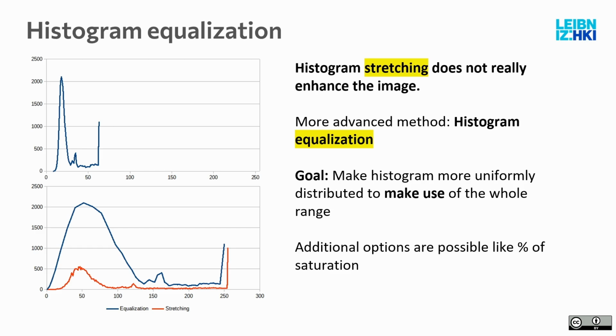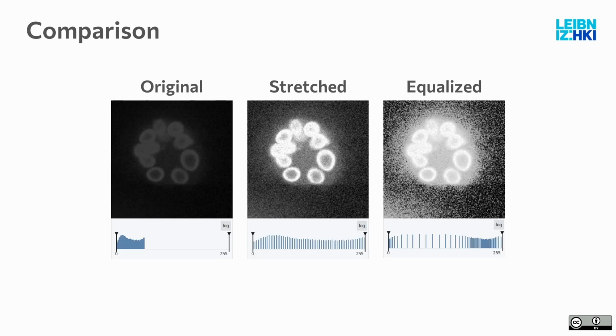And you see here as output that it's actually not uniformly distributed. You see here the stretched histogram, and then the supposedly uniformly distributed equalized histogram. Why is that? Because we have discrete values here, and it just doesn't work. The histogram equalization mathematically would make a uniform distribution, but it assumes continuous space. We don't have this here. So don't be surprised if it doesn't look super uniform when you actually use this method. It is just limited by the mathematics versus how the computer works. So let's try and see what happens.